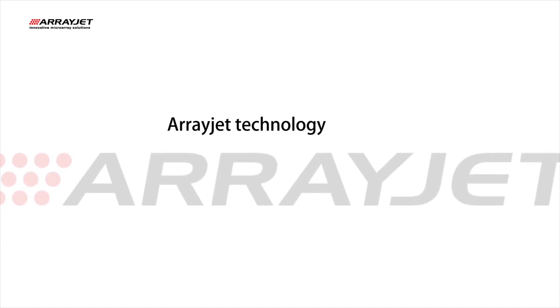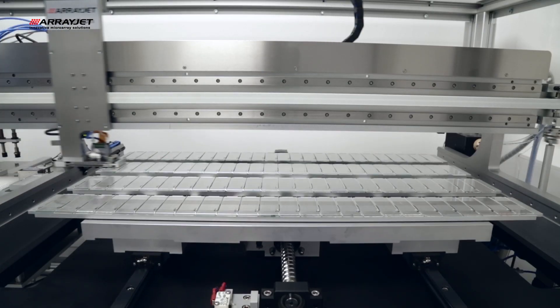ArrayJet technology offers true inkjet printing capabilities through non-contact, on-the-fly printing.